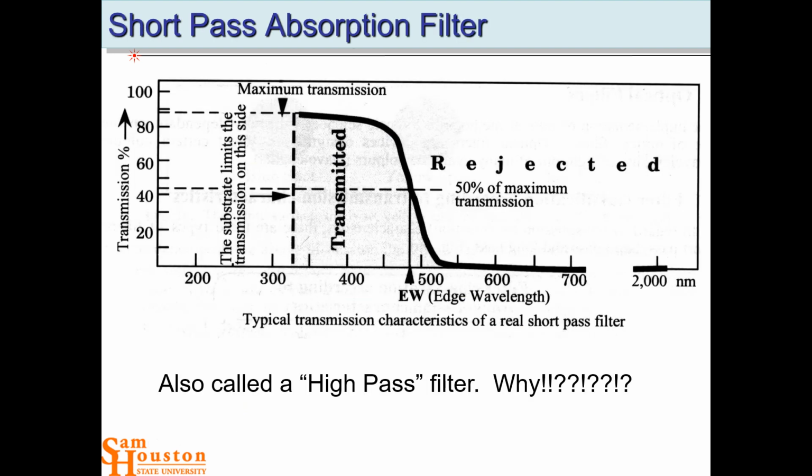And so these are some photographs from the text. And I want to explain what's going on. You'll get this if you buy a filter set, it'll probably have pages and pages of spectra of your filters. And this is the kind of thing that you're going to see in the little manual that came with your filter set. And I want you to be able to read it and know what kind of filter this is.